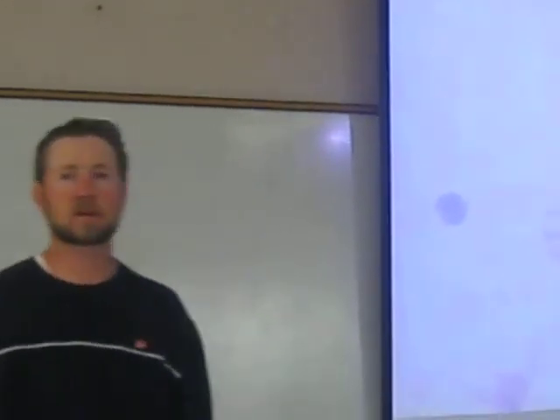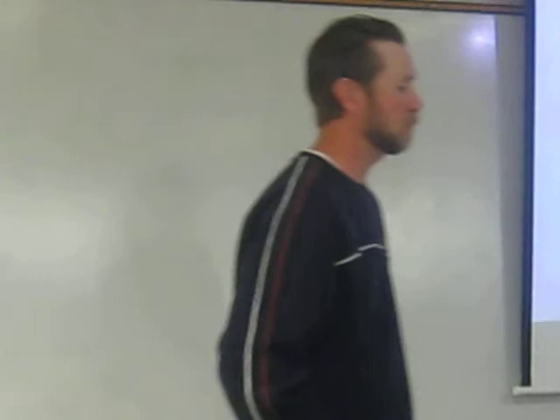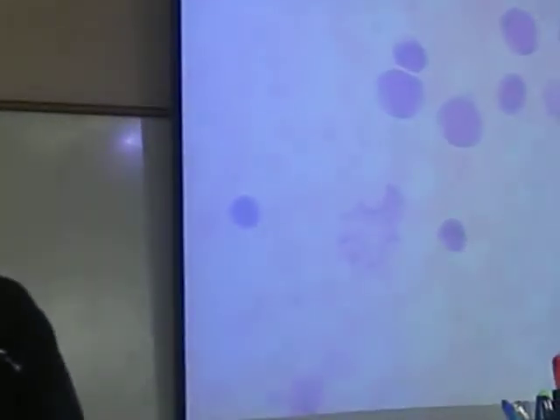I'll give you a hint. You're not going to find hardly any basophils, if you find any. You might get one. If you're lucky, you'll have 2. Eosinophils, you'll find a few, maybe 2 or 3. The rest should be pretty numerous, so you should be able to find quite a few of those. But eosinophils and basophils, there's not that many on the slides. They're more difficult to find because they're not that abundant in the blood tissue. So you'll only see a couple of those.